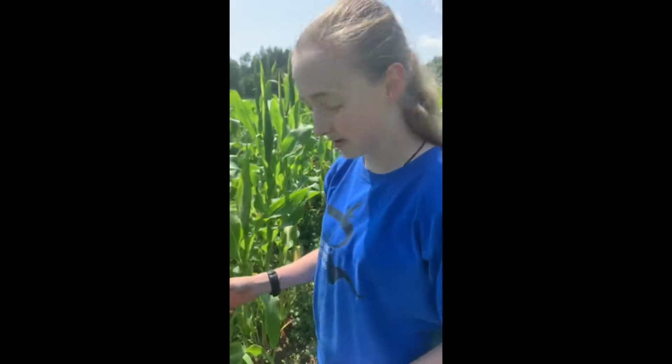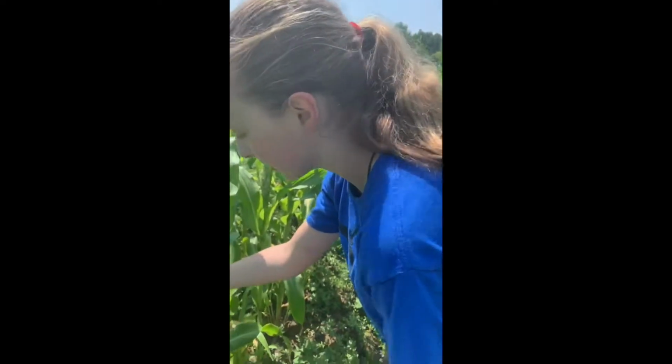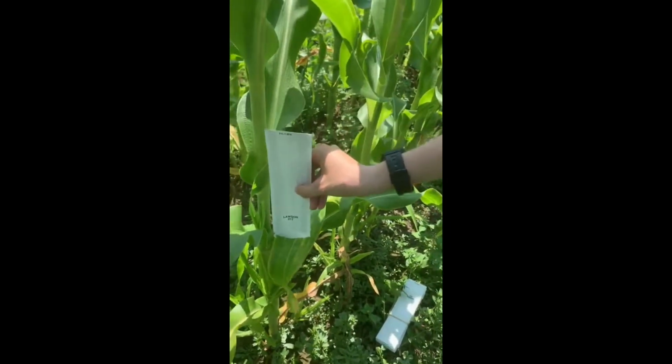One of our many field tasks to complete was shoot bagging. It ensures that the ear is pollinated correctly when we make specific crosses between corn plants. The first step of shoot bagging is, of course, to find the ear that you want to put the bag on. We usually just pollinate the top one, so if there are multiple, you can just ignore the ones that are lower. They're usually hiding behind the leaves here. Now this one looks about the right size. You want to make sure that it's big enough so that the bag will not fall off of it.